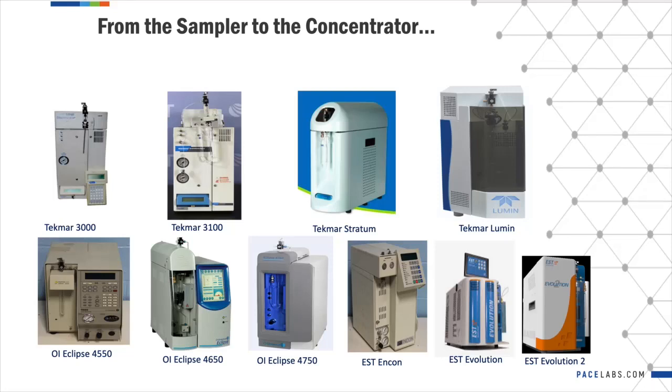After the sample has been taken from the automated sampler, it's sent to the concentrator. As you can see here, concentrators have also undergone a lot of changes in the last few decades. In fact, I think I've worked on almost every iteration of one of these concentrators in my time in the industry.